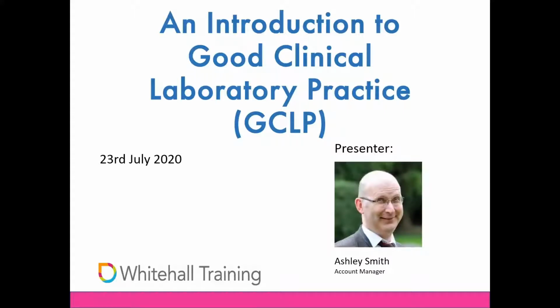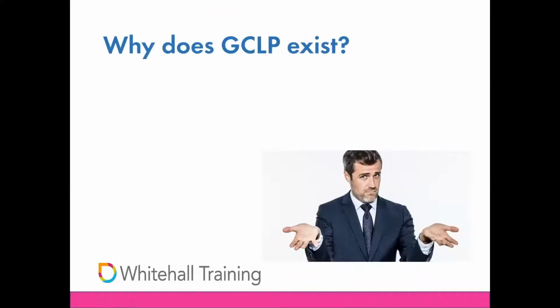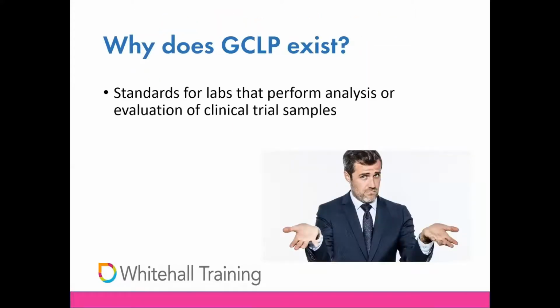So let's go into GCLP and start with what GCLP is and why it exists. Put simply, GCLP is a set of standards for the labs that perform analysis or evaluation of clinical trial samples. Now, the standards have been designed because this work needs to be done in compliance with all the rules that apply specifically to clinical trials activities.